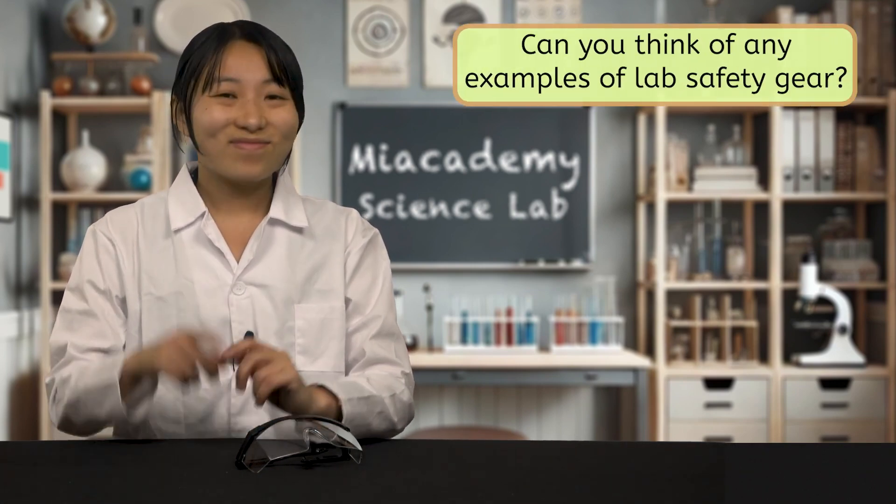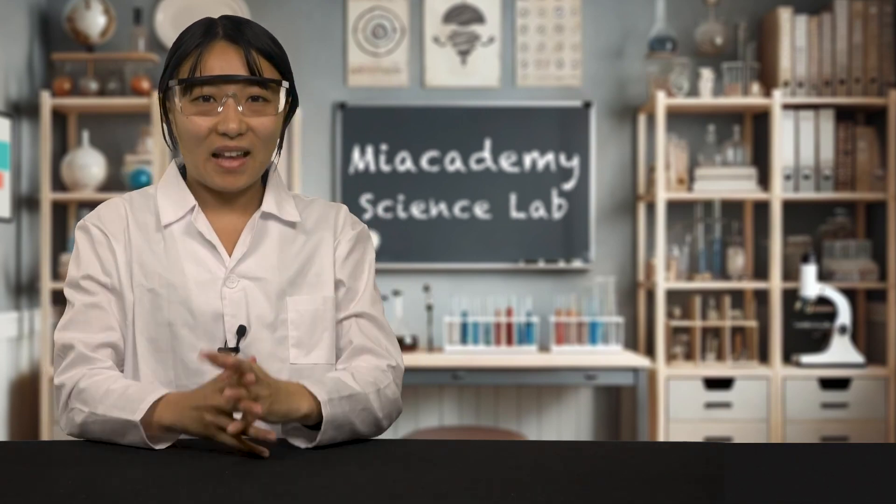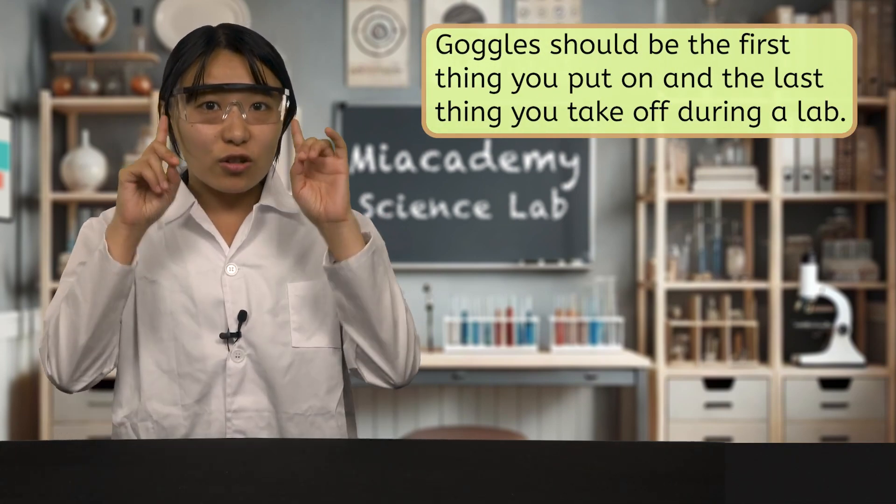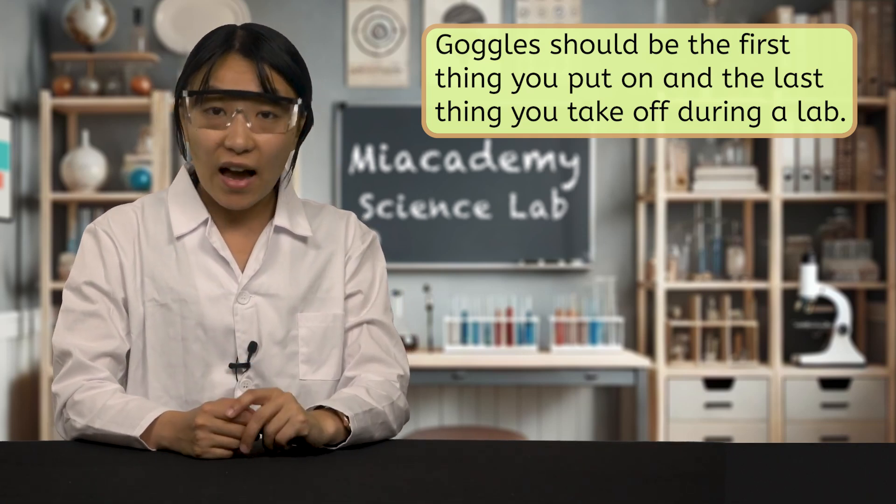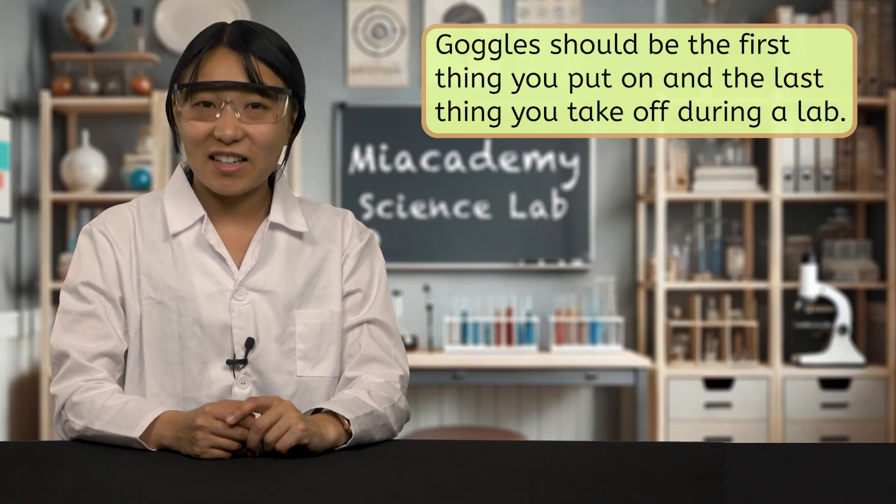The second P is Protect. This is where you gear up, just like you'd wear pads or a helmet during a football game. Protective equipment in a lab keeps you safe from spills, splashes, and other surprises. Can you think of any examples of lab safety gear? Start with your eyes. Goggles are a must to protect them from any chemicals or flying bits. In any science lab investigation, goggles should be the very first piece of gear you put on and the very last thing you take off after you've finished the lab and clean up.